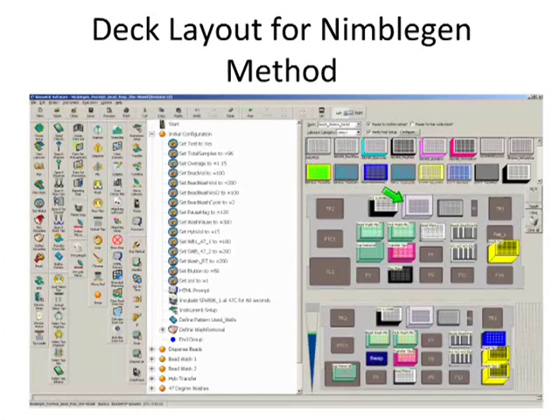But more importantly, the same tip always goes into the same sample, so that it further minimizes the potential negative effect of that. But regardless, it becomes a non-existent issue. It also is very helpful as a waste solution, disposing of materials. And then everything else is again fairly standard on the deck.